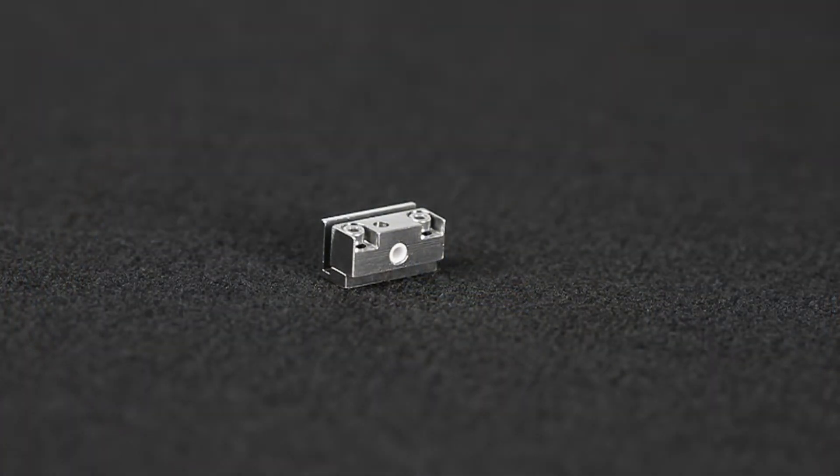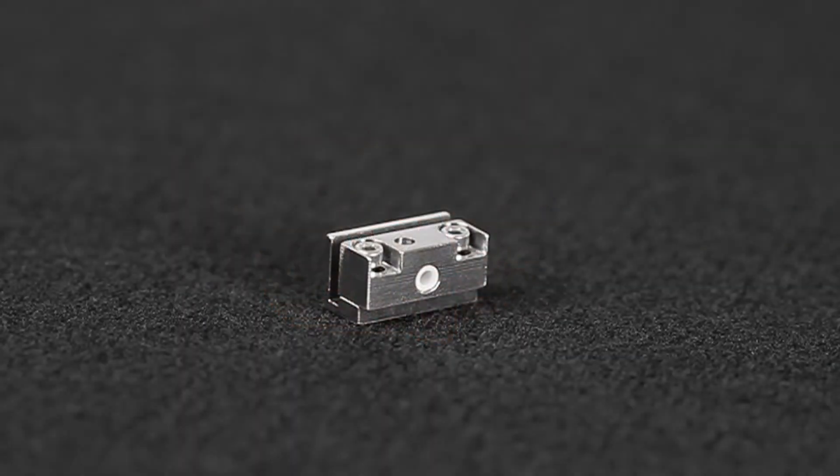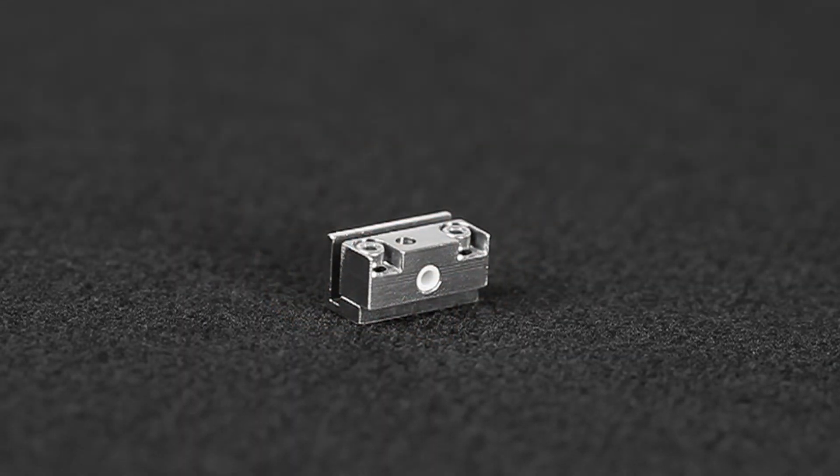Here you can see the thin film holder. It is made out of stainless steel and has an opening here for the thermocouple to get closer to the sample for more accurate measurements. This particular thin film holder can go up to 400 degrees.